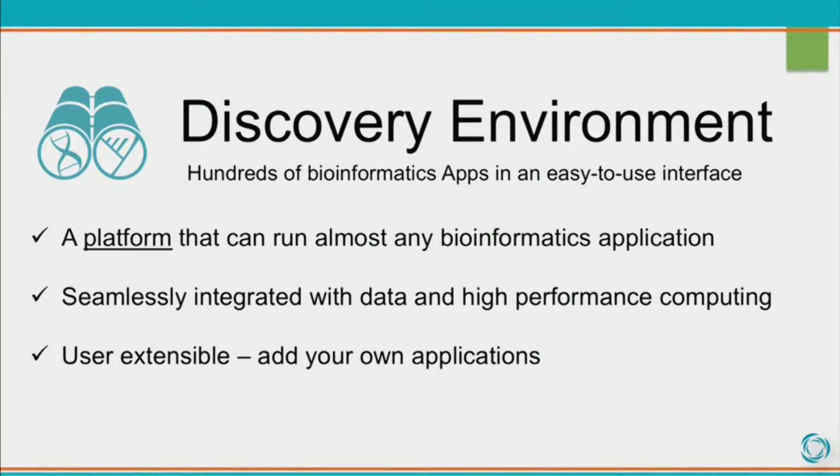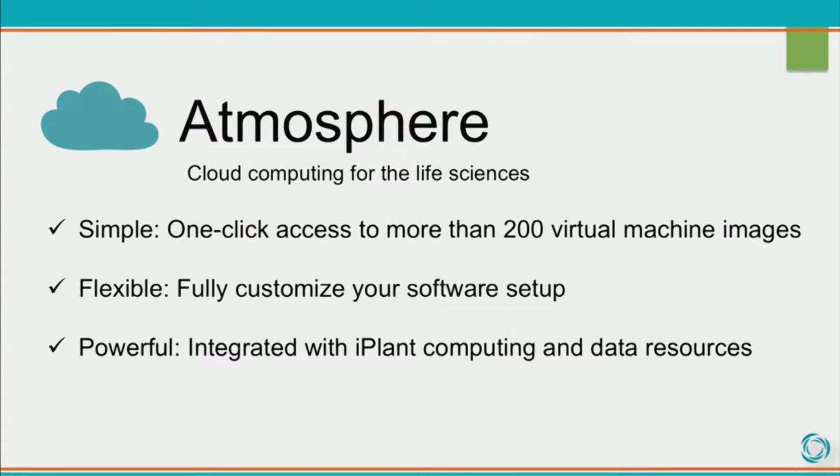The Discovery Environment is really important for the majority of bench biologists who may not come with a command line computing background. It's an environment where you can use hundreds of bioinformatics applications in an easy-to-use web interface. You can run just about any bioinformatics application that would normally be run at the command line. It's already integrated with our data sets and compute, and it's user extensible, which means you can bring your own applications and run them in the Discovery Environment.